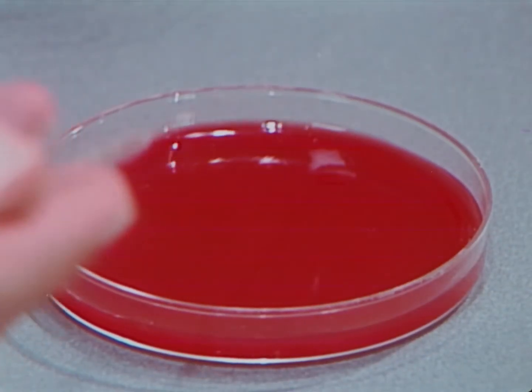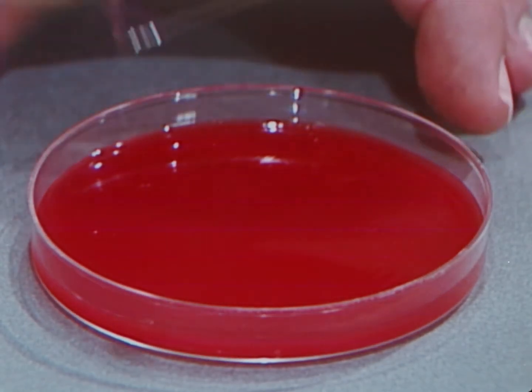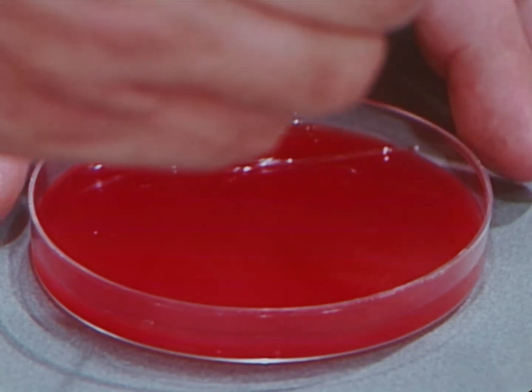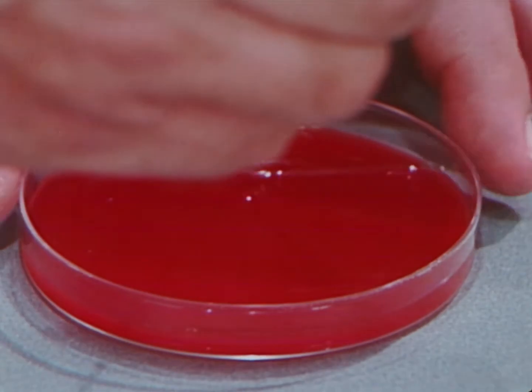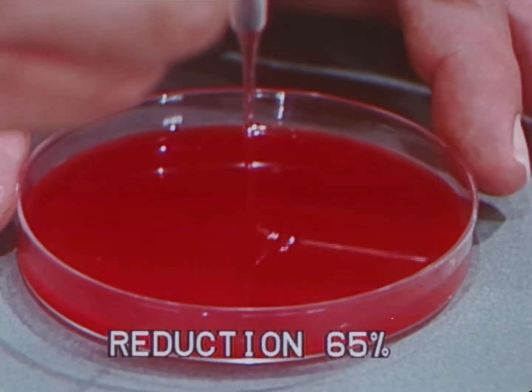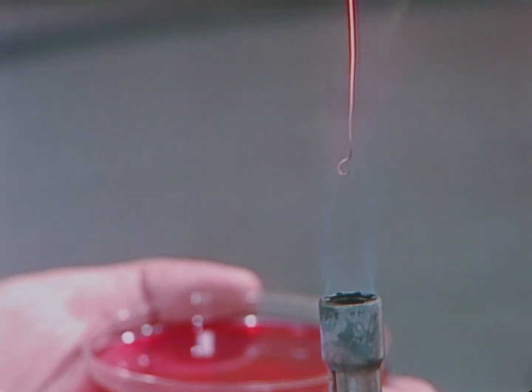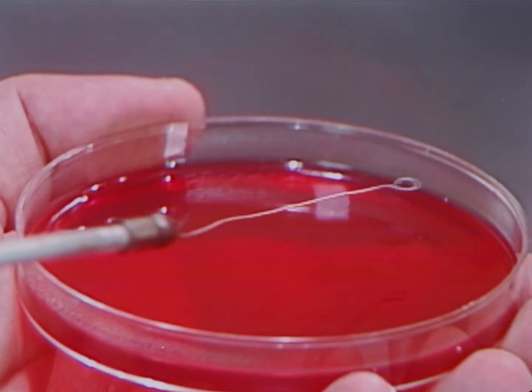The aerosols may be further reduced by spreading the inoculum with a sterile bent glass rod. Using the bent glass rod reduces aerosols as much as 65%, even on rough agar. The inoculating loop is often sterilized in the flame of a Bunsen burner.